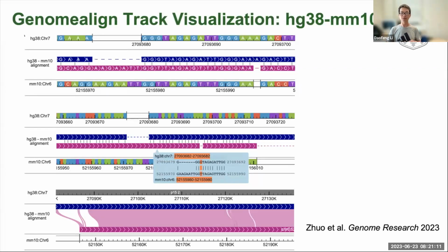For the sequence and strand information, it displays arrows that indicate the forward or reverse strand. The syntenic nucleotides from these two species are vertically aligned, and gaps are inserted. If there's a match, you can see vertical tick lines; if it's a mismatch, there's no tick here.